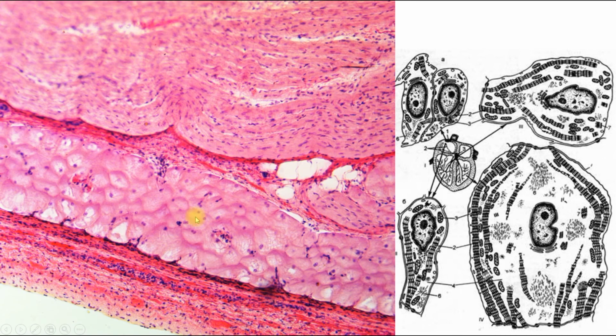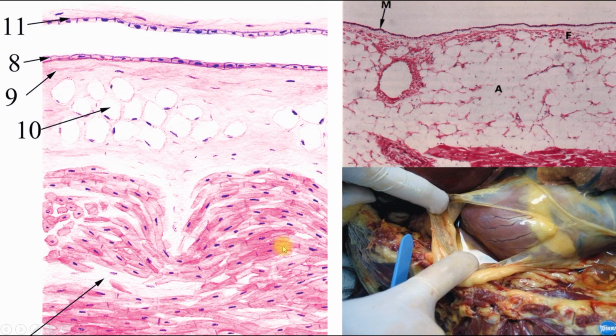And here we can see Purkinje fibers, third type of conductive cardiac myocytes. They are located under the endocardium in the heart. And the outer layer of heart is epicardium. It covers heart and it's a serous membrane. And epicardium is the visceral layer of pericardium. So pericardium has parietal and visceral layers.